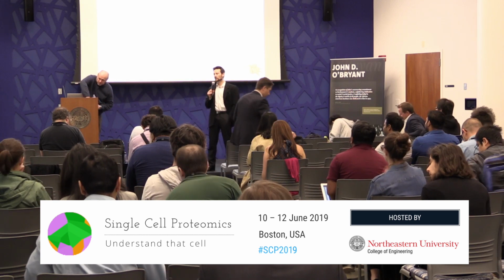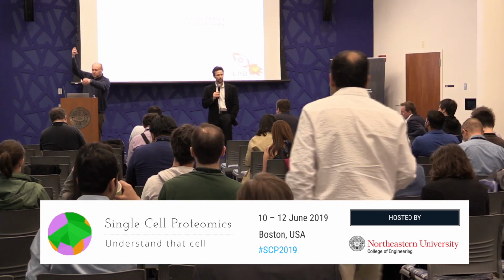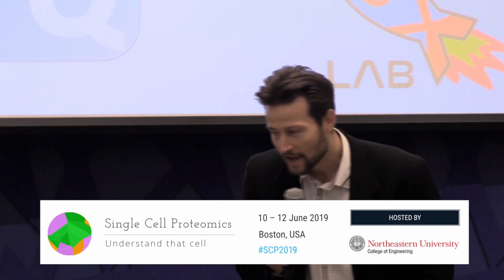And the first talk is going to be from Jürgen Cox, who of course doesn't need introduction in the proteomics community, but because this is a more mixed audience, I'll say that he is the person behind the most popular software platform for analyzing shotgun data-dependent acquisition mass-spec data.